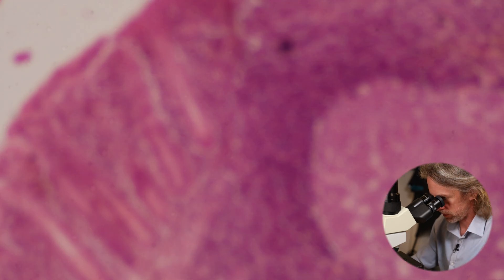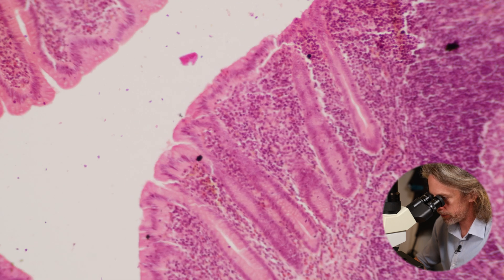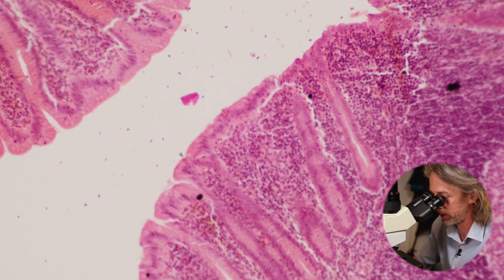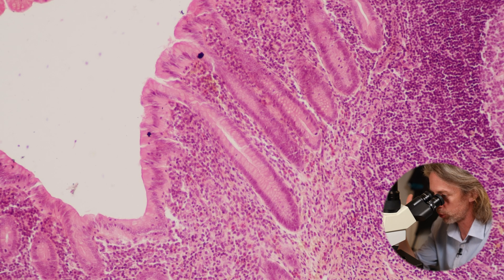Jumping up to the 10-times objective — that's 100 times magnification. We're not seeing any villi — those finger-like projections into the lumen that we saw in the small intestine. We are seeing an epithelium and intestinal crypts, and it looks like those crypts are filled with goblet cells. That looks very similar to what we saw in the large intestine. Let's jump up to the 20-times objective.